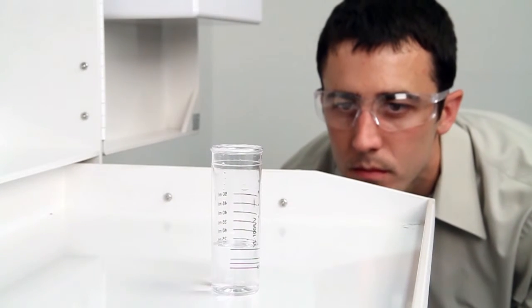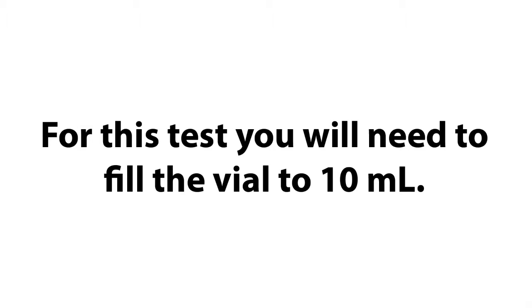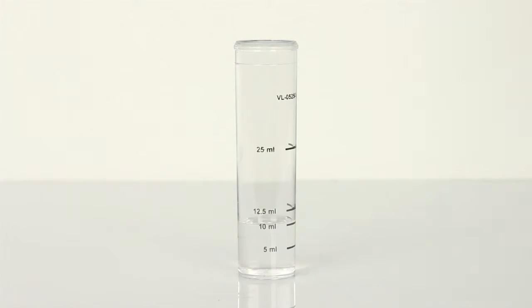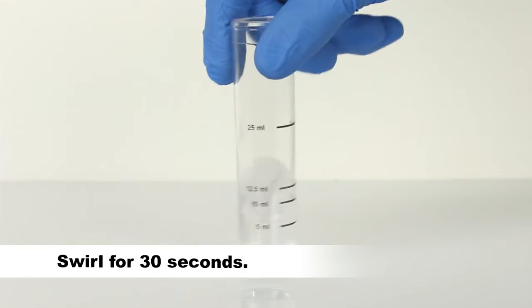Using a white background can provide contrast to help you better see the color changes. A cabinet tray or a white paper towel can provide that contrast. For this test, we will be using a 10 ml sample. If sulfites are present, add 6 drops of hydrogen peroxide 3%. Swirl for 30 seconds to mix.